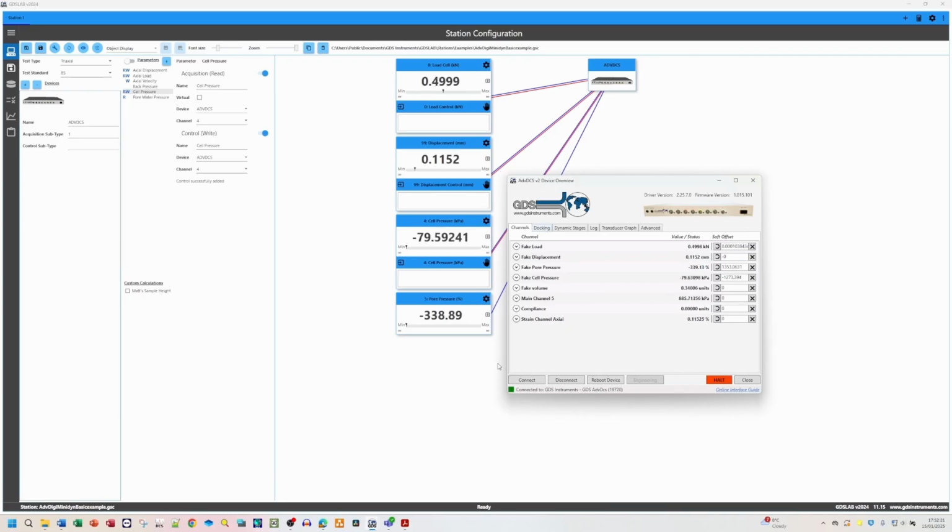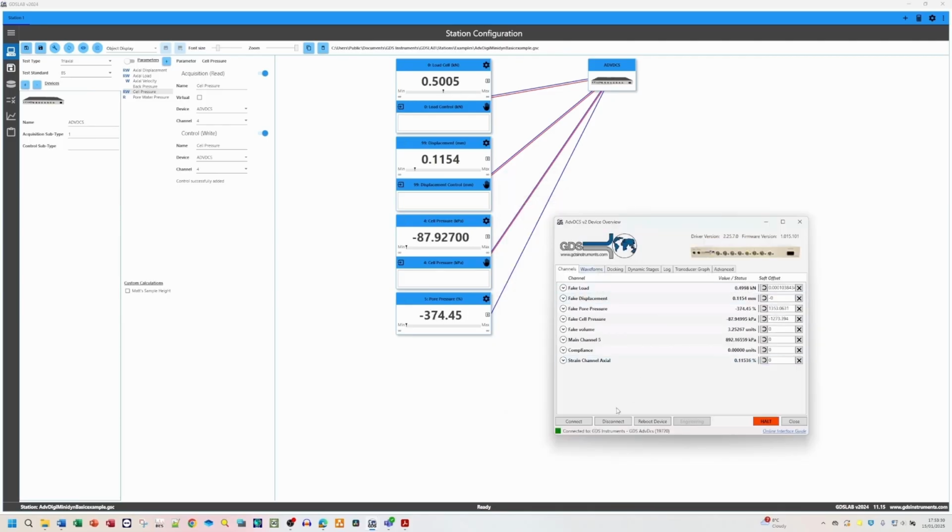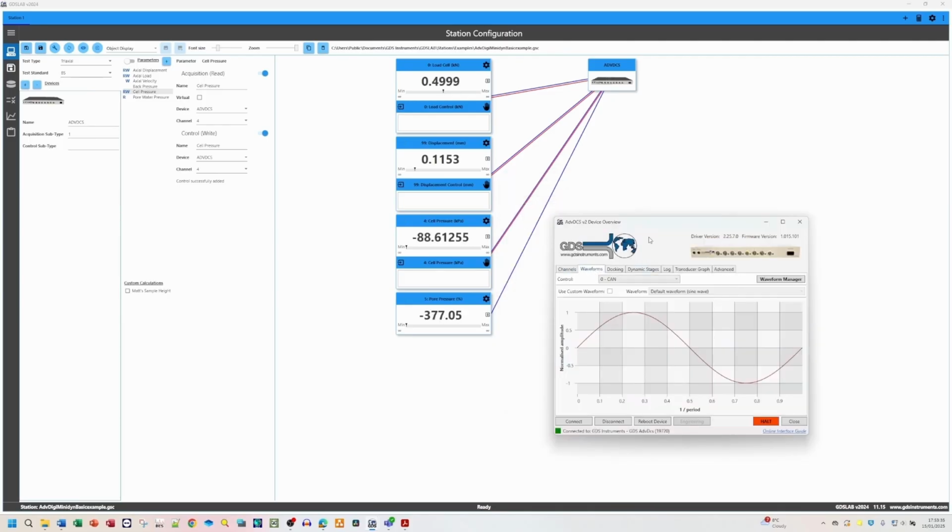Key features include real-time graphs, which enable real-time graphing of individual channels by selecting the RT graph checkbox, and graph display live data trends, aiding in monitoring test parameters dynamically. Moving on to the waveforms tab. This can be used to configure waveforms for dynamic cyclic tests. The Calamari unit is pre-configured with a sinusoidal waveform and supports custom waveforms through an upgrade.